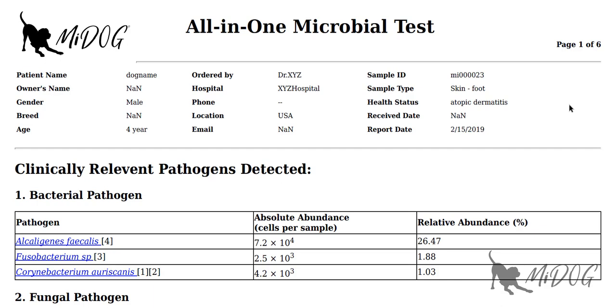After we process and analyze the samples we received, our vets receive a comprehensive and detailed report outlining the results of the sample via email. When you click on the link that we sent you, you should open a report that looks something like this. This video is going to help you navigate through the report while explaining the terminology and providing interesting insights so that you can make the best decision for your patients.